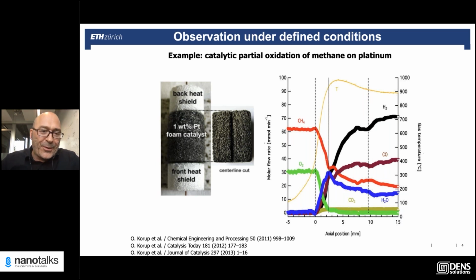So what I want to point out here is that if someone gives you some sample that he or she abstracted from a catalyst reactor, and you go now and take a few particles, go to the TEM and study all details, if you don't really know what kind of environment that particle has really seen in your reaction bed, then you might be lost. This is just one example of how representative the state is that you are studying for the system.